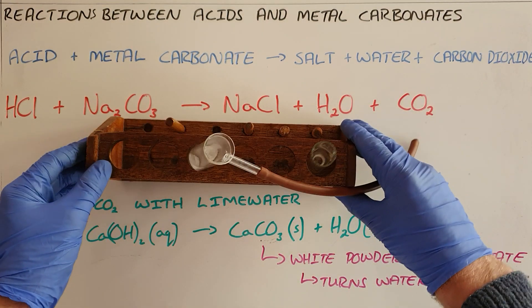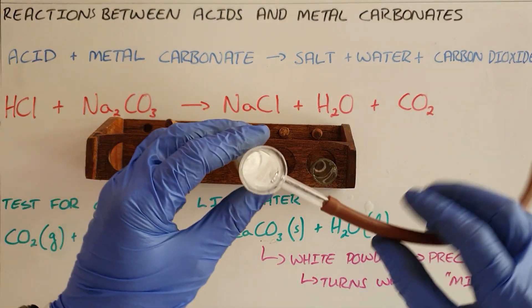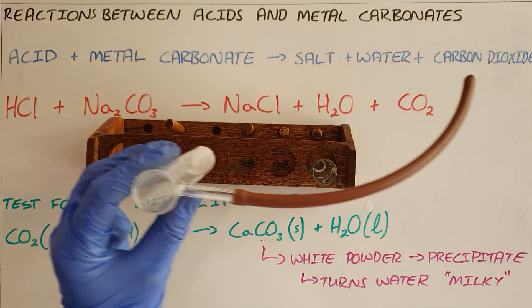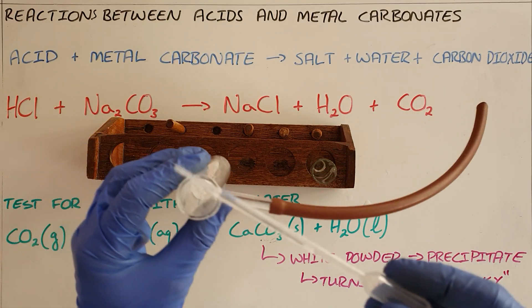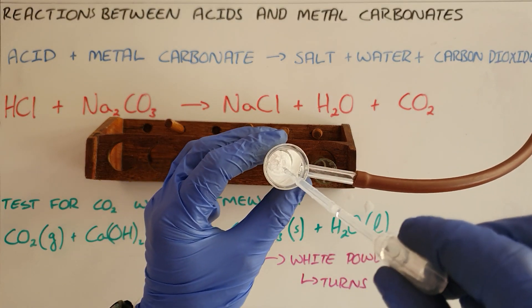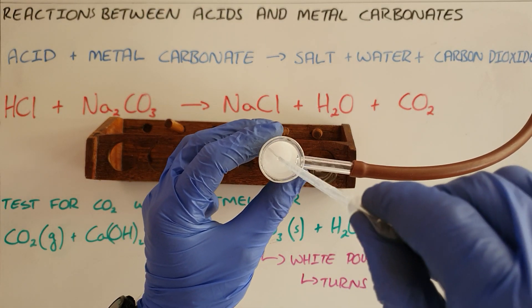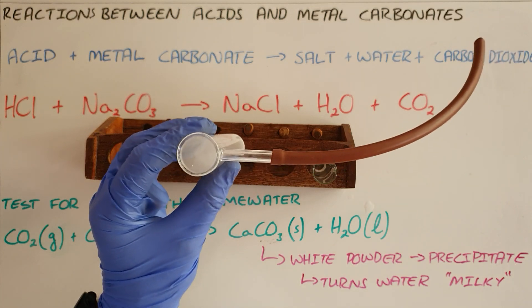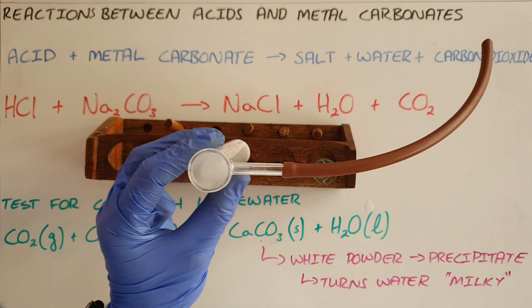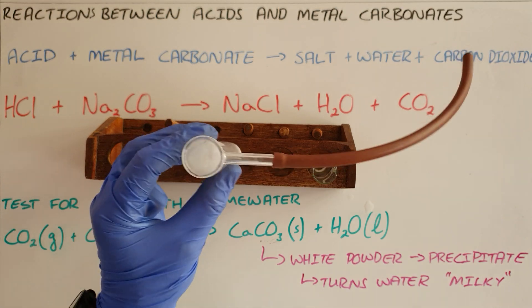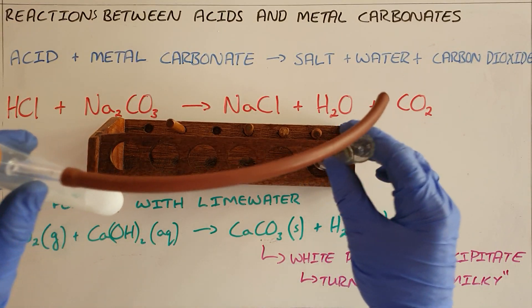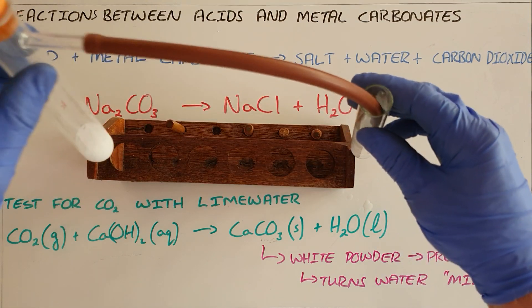Here we have our setup. We have our sodium carbonate in this test tube. I am going to start by adding the acid to this test tube. We can see that a reaction starts immediately. We perform the lime water test by putting a stopper onto this test tube, which forces the carbon dioxide out.